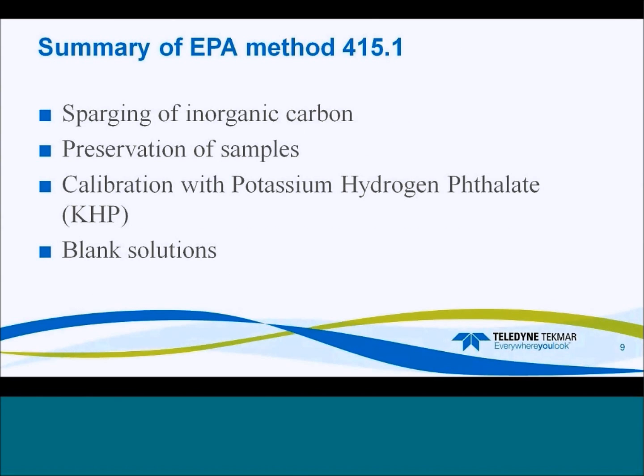This method also requires that the inorganic carbon be sparged, and that calibration is performed with KHP. And just like 5310B, you should analyze blank solutions. And your blank solution for both 5310B and 415.1 should be the same water source as you use to prepare your standards. So this is an overview of your 5310B and 415.1.